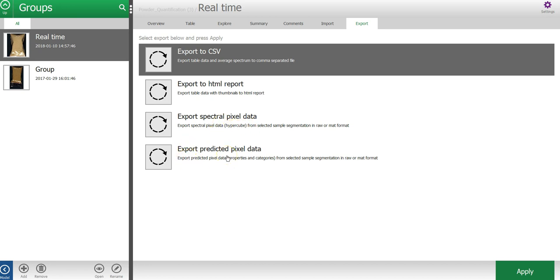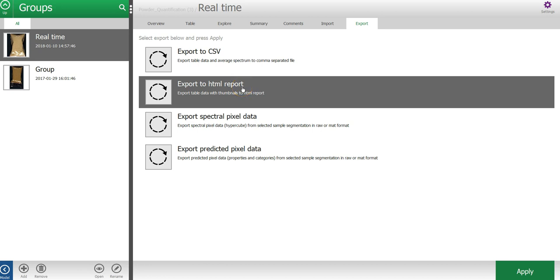You can also export your pixel data as spectral data, which is a hypercube, or as the predicted values. In this case, the percentage of the three powders, but for each pixel. The HTML report can be viewed in the internet browser. It can be easily shared with your colleagues, even if they don't have the Breeze software.